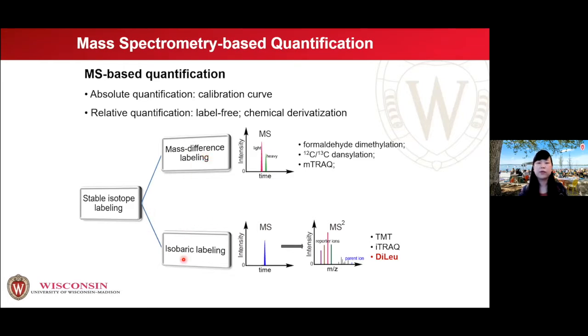Alternatively, people increasingly turn to isobaric labeling. This relies on a set of chemical tags that give rise to the same mass. In MS1 mode, they show as a single peak, so there's no spectral complexity involved. However, MS2 allows the production of reporter ions for you to get relative quantification for multiple samples, and MS2 for identification.